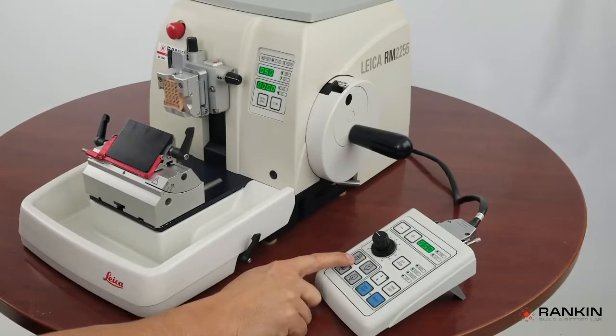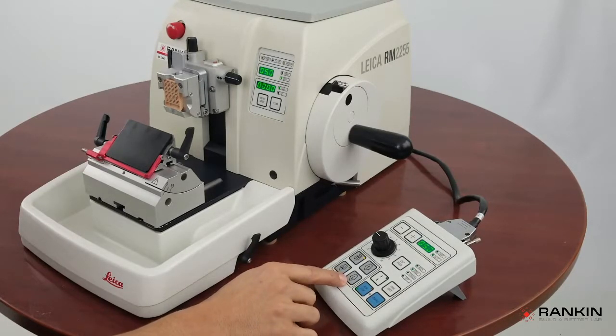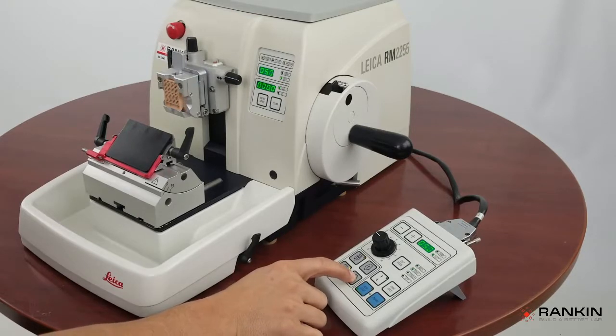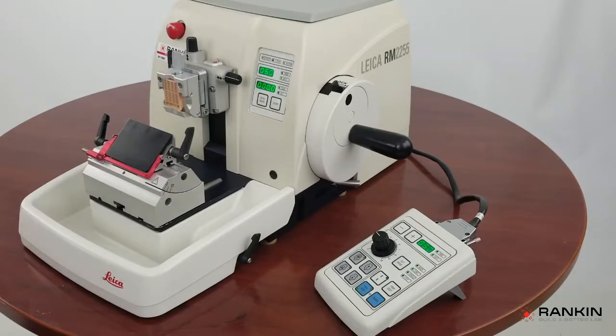Your course advance and course retract buttons will move the specimen head at about 900 microns per second, and your fine advance and fine retract button will move the specimen head at about 300 microns per second.